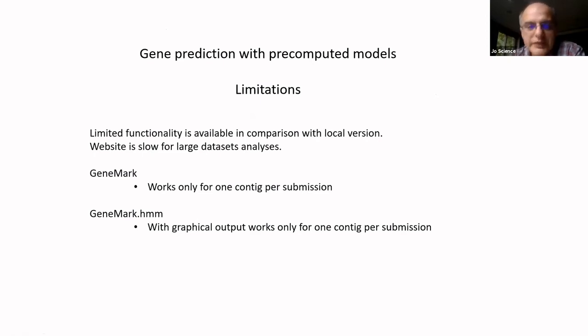It's very convenient to use the website, but there are a couple of limitations. One is that the software is capable of doing much more. We have support for more options, and when you are working with a single contig, it's okay to submit it through the website, but if you want to analyze hundreds of genomes, sometimes thousands, in many projects, sometimes we run 12, 15,000 genomes in a day, then you have to download the software and install it locally.